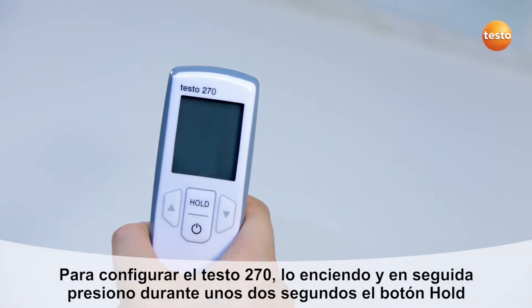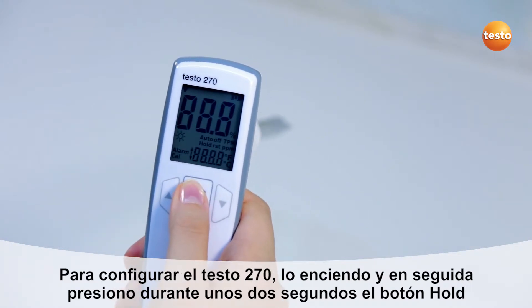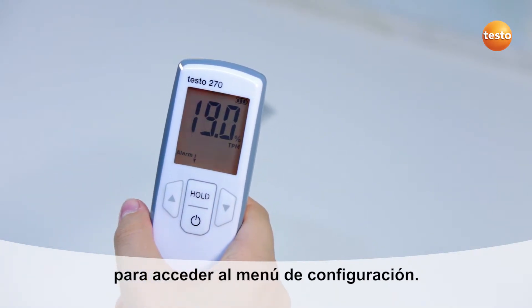In order to configure the Testo 270, I switch it on and immediately press the hold button for 2 seconds in order to access the configuration menu.